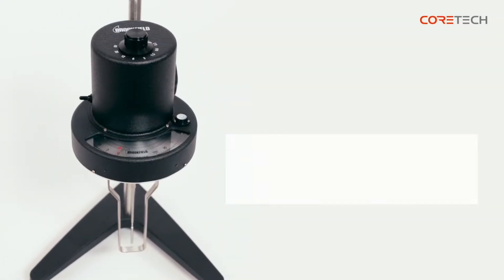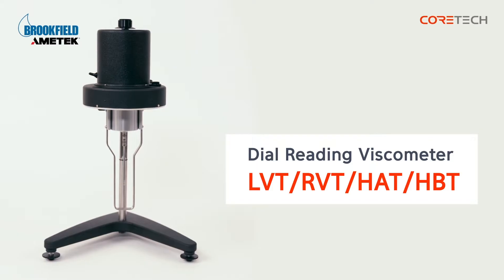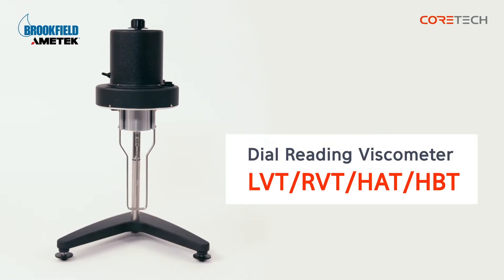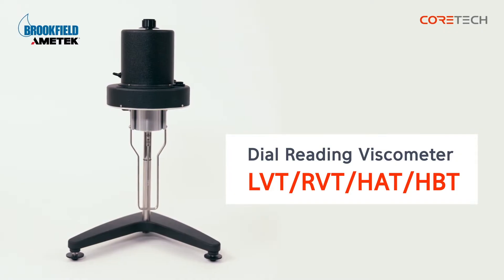Hello, this is CoreTech Korea. The product we're going to talk about today is Brookfield's Dial Reading Viscometer. The Dial Reading Viscometer is the basic viscometer of the Brookfield Viscometer. This product is easy to install and use. Unlike digital viscometers, where viscosity values are directly displayed, torque values are multiplied by factor values and converted into viscosity values.